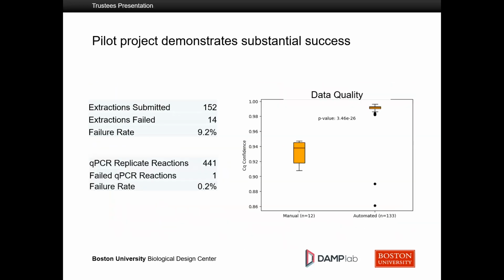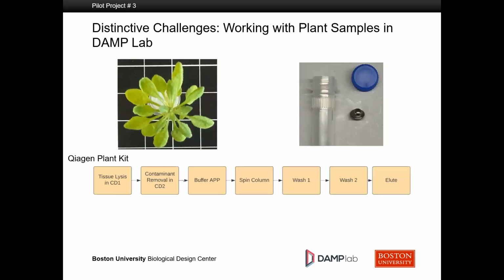You definitely would have to test it, but like I said here, the first 2 steps that we use from the QIAGEN kit in this process have to do with the reduction of inhibitors and the lysis of the tissue. That kit is compatible with a large number of different plant samples, model organisms and non-model organisms. So we just use those 2 elements to create a solution that's ready to be put into your DNA isolation pipeline. And it worked really well, surprisingly well.